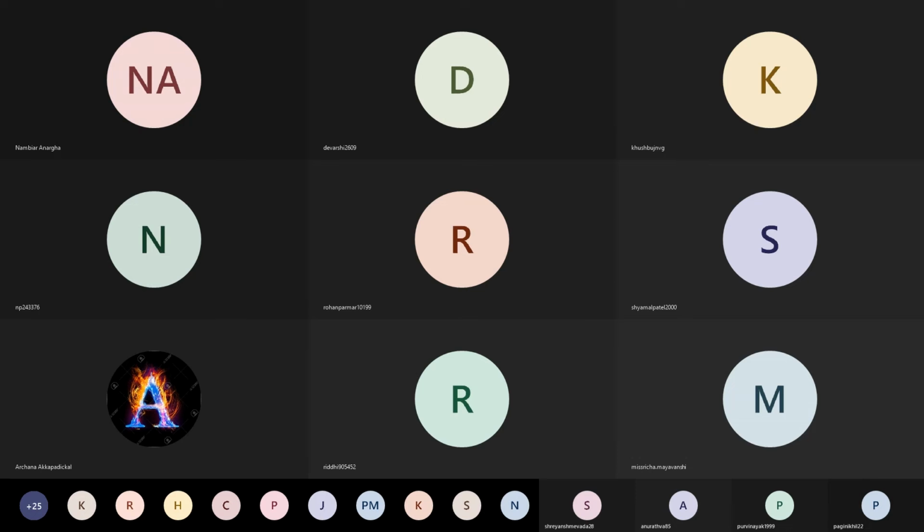What is the reaction between iodine and the drug molecules? Why does iodine react with the drug molecules? The basics of TLC: the stationary phase is polar, non-polar. What is the composition of the stationary phase? Based on what do we choose a solvent system, the mobile phase system? How do we prepare the solvent system?